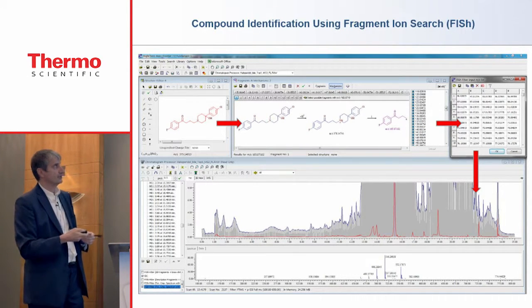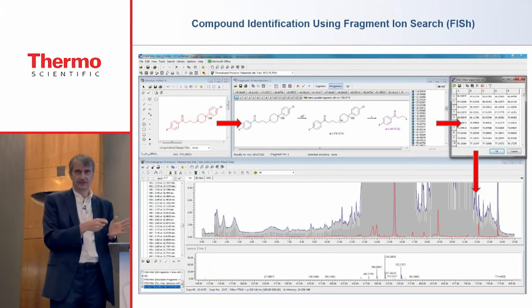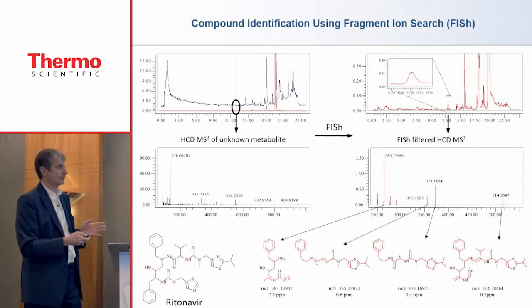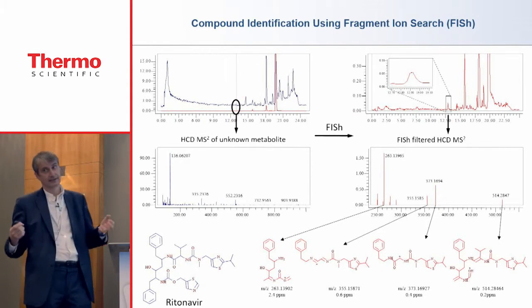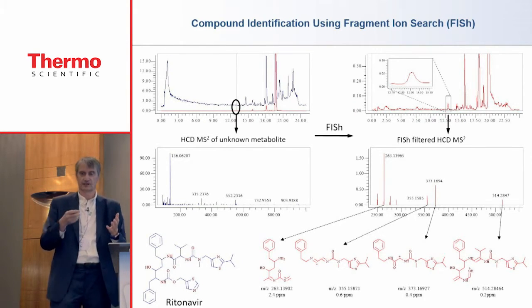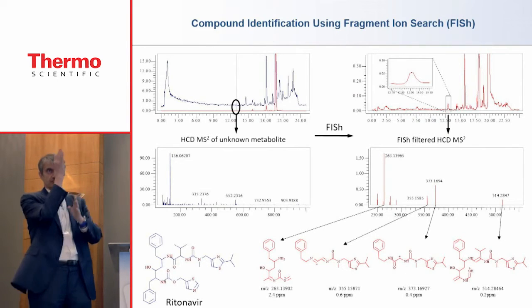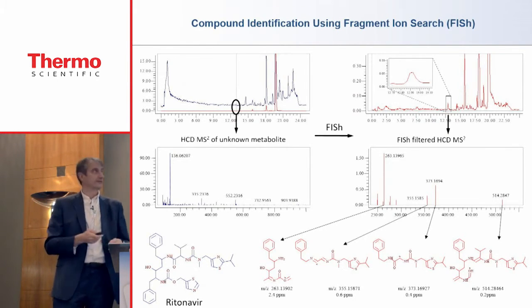The advantage of this method is not only that it shows you the peaks that are related with your investigated compounds, it gives you also some partial substructural information. And then I have to admit, you have to put it manually together and make sense of all these results. But at least you can see what kind of substructure belongs to which chromatographic peaks.